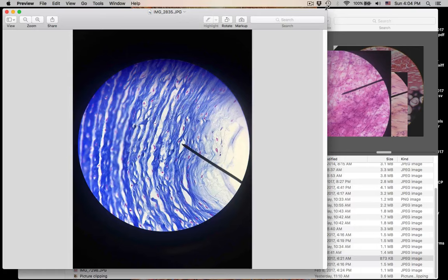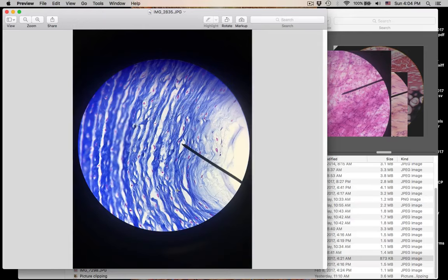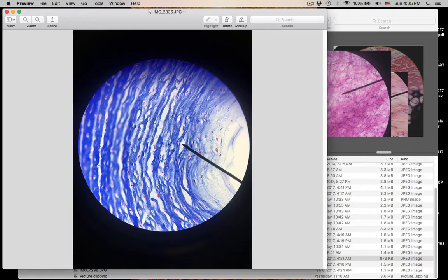Here's this connective tissue — number twenty-two. Write down the name of the connective tissue. Tell me the name of the protein fibers that are in the matrix. What are these blue protein fibers called? And tell me three places where you could find this type of connective tissue. So: the name of the connective tissue, the name of the protein fibers in the matrix, and three places where you could find it.